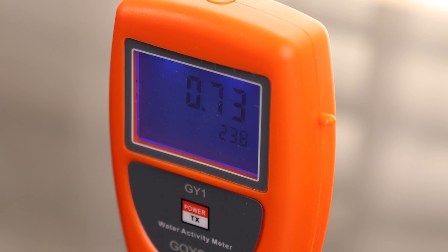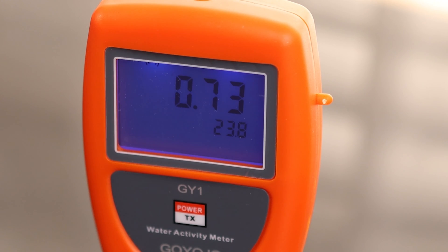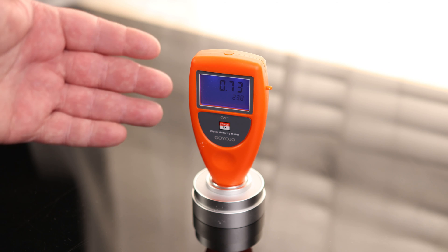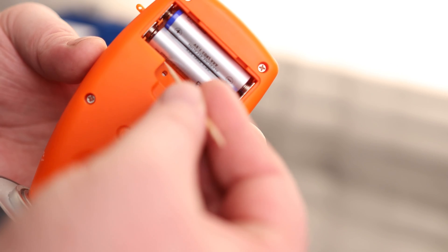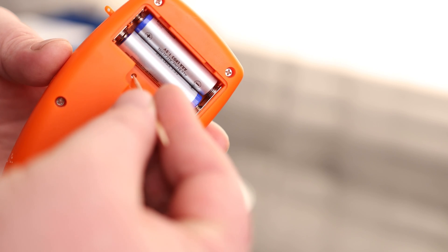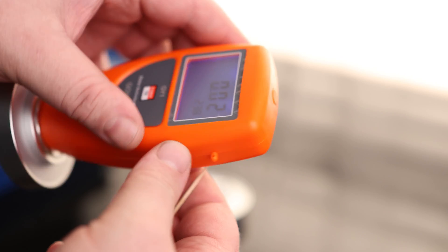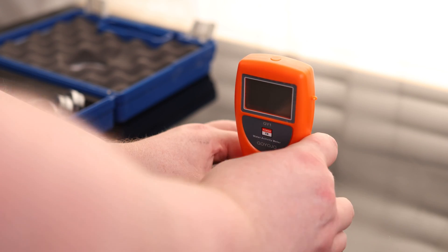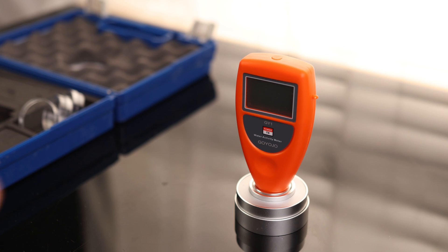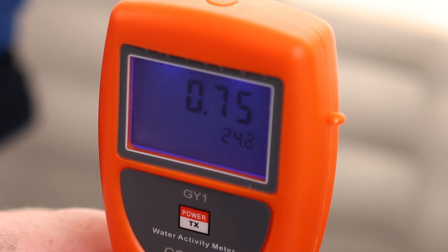We are looking at 0.73, and it's supposed to be 0.75, so that is pretty darn close — within 0.02, which is an acceptable tolerance. If we want to tighten that up, the left button is to increase and the right button is to decrease. Just pressing the toothpick on the orange part of this button. Now we are calibrated 0.02 above. I'm going to reseal it and give it another 10 minutes to recheck. And there we go — a perfect 0.75.